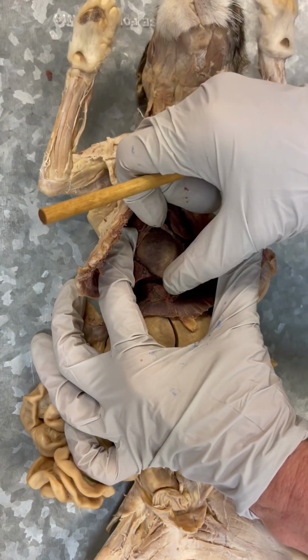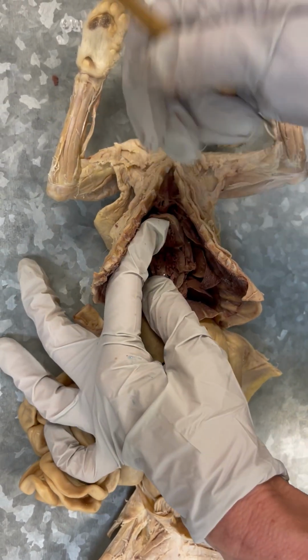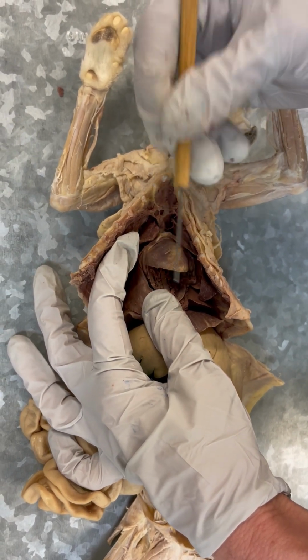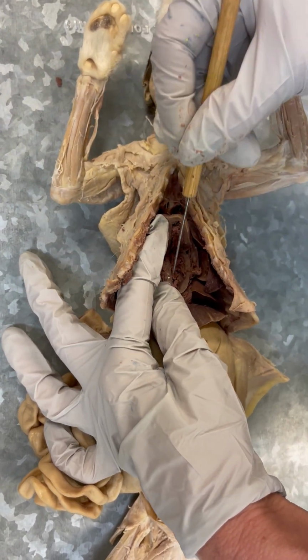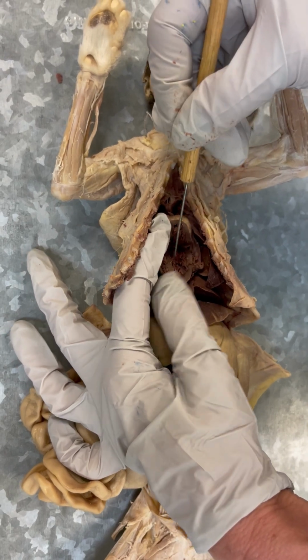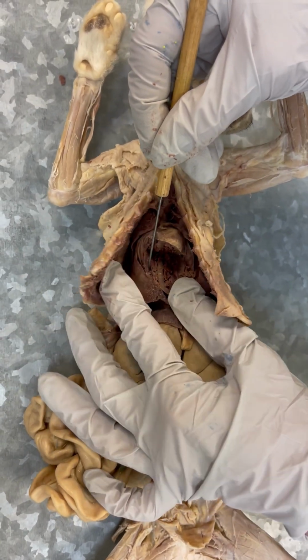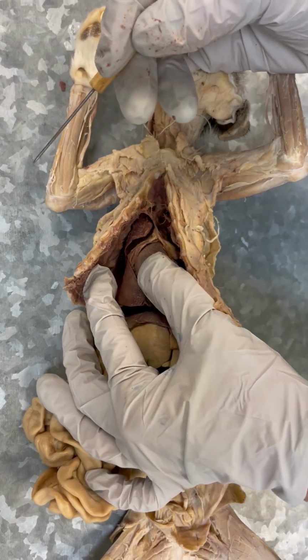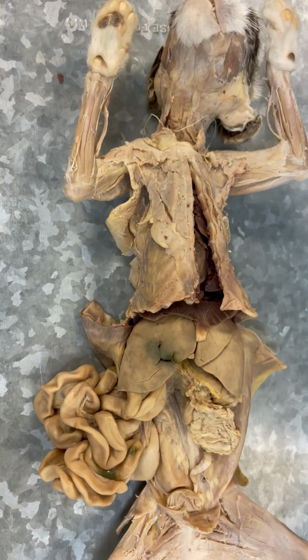This is the heart. When we open up the heart, we can see that the left side walls are much, much thicker because the left is responsible for systemic circulation, and the wall of the right ventricle is much, much thinner because it only has to go to pulmonary circulation. And that is everything in a cat.